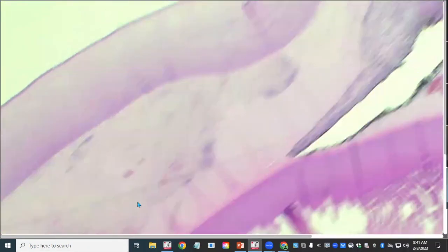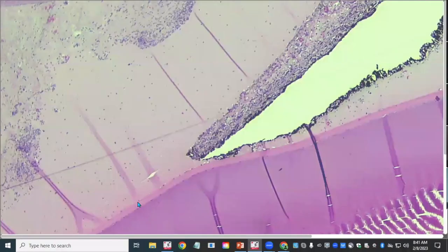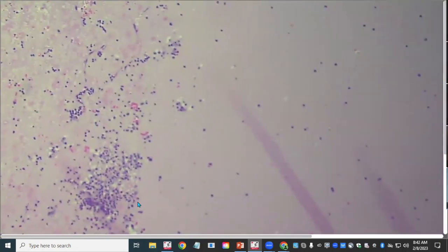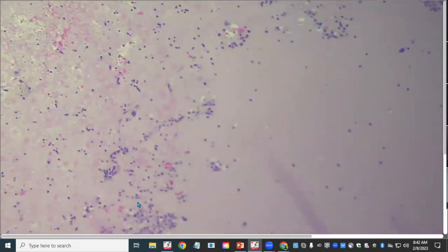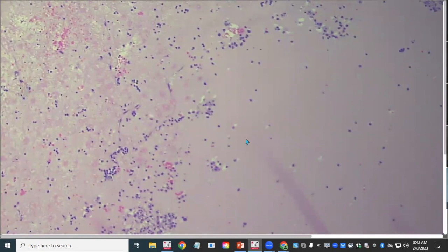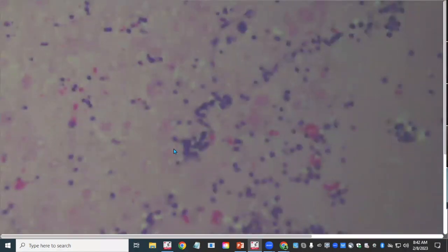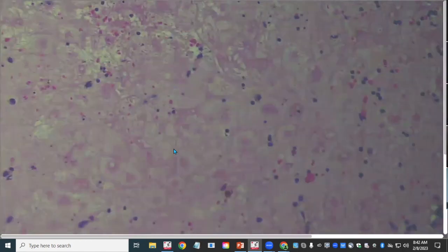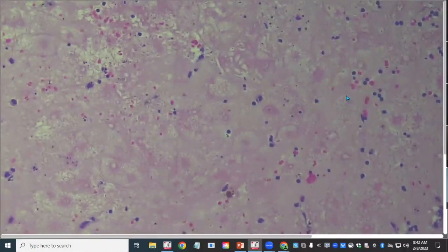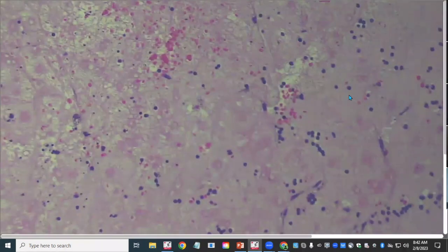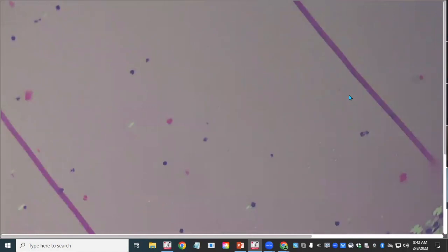The anterior chamber exudate demonstrates '50 shades of pink': more homogeneous protein-rich exudation on one side transitions to fibrin on the other. Fibrin, free-floating neutrophils, macrophages, lymphocytes, plasma cells, and red blood cells are all present. A similar exudate fills the subretinal space in the context of complete retinal detachment.